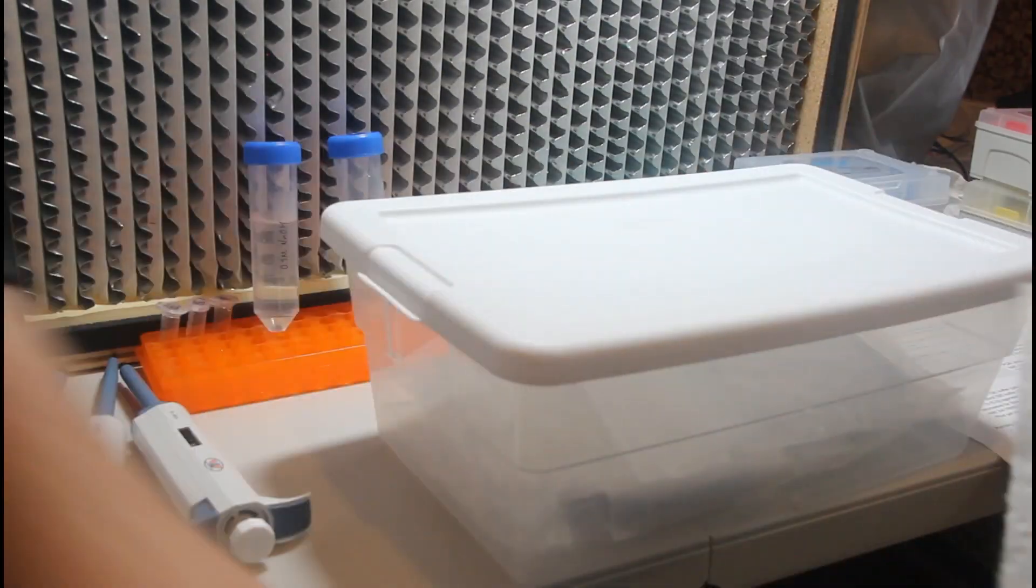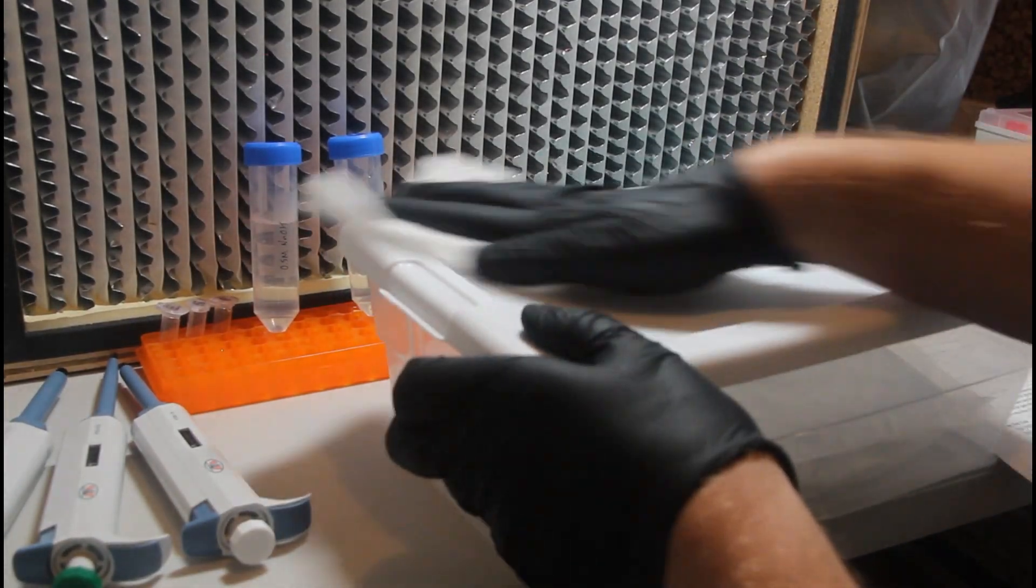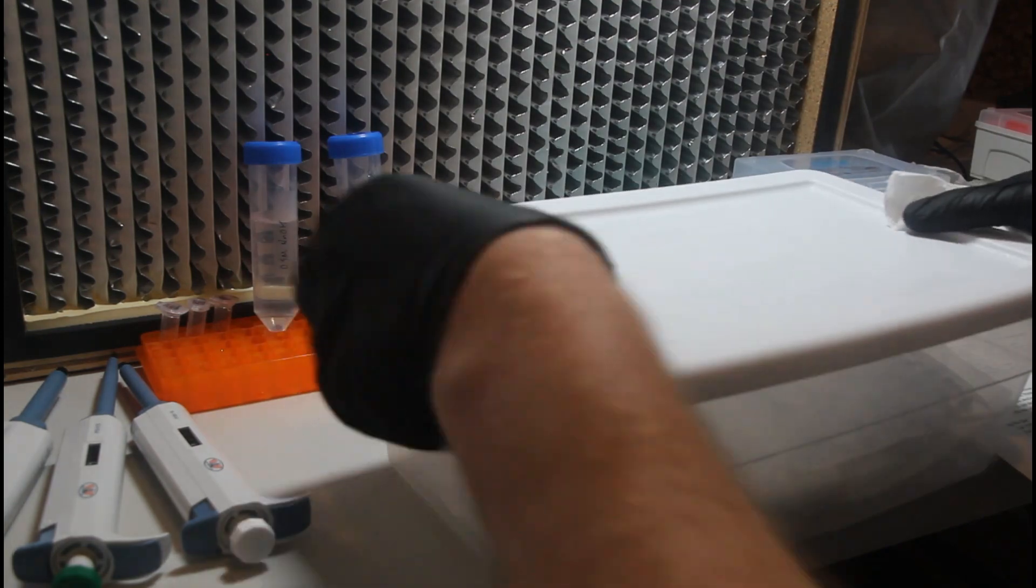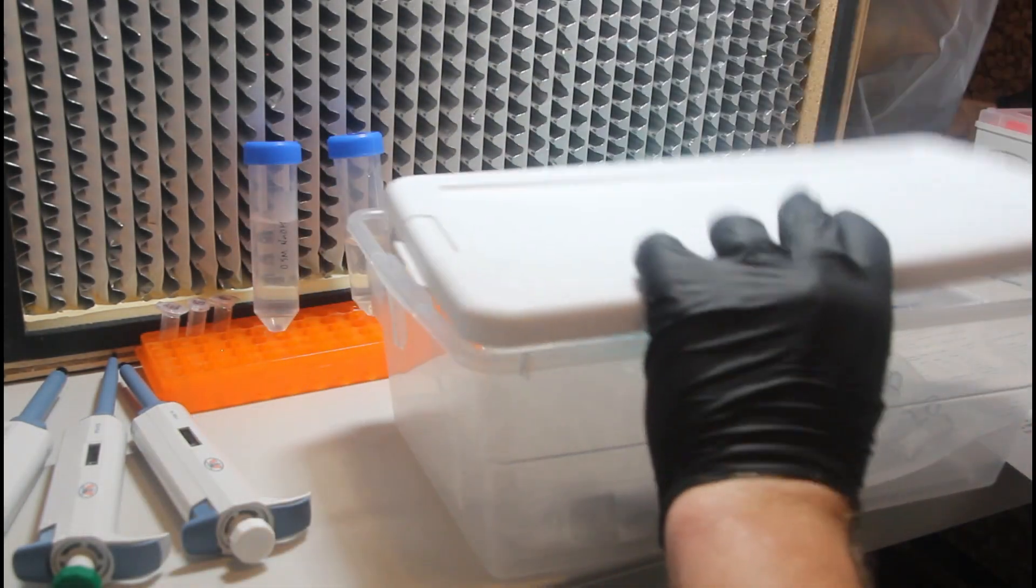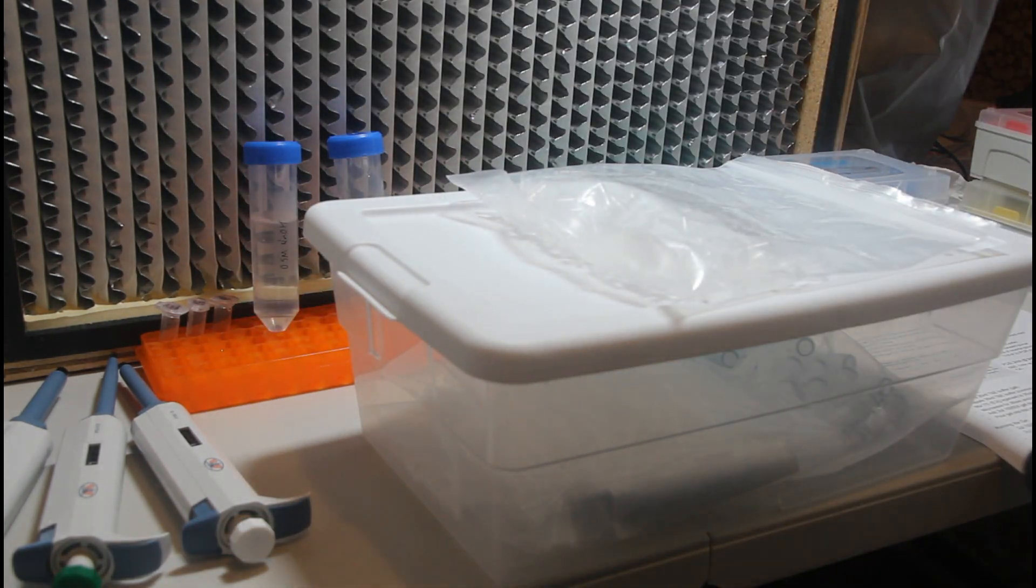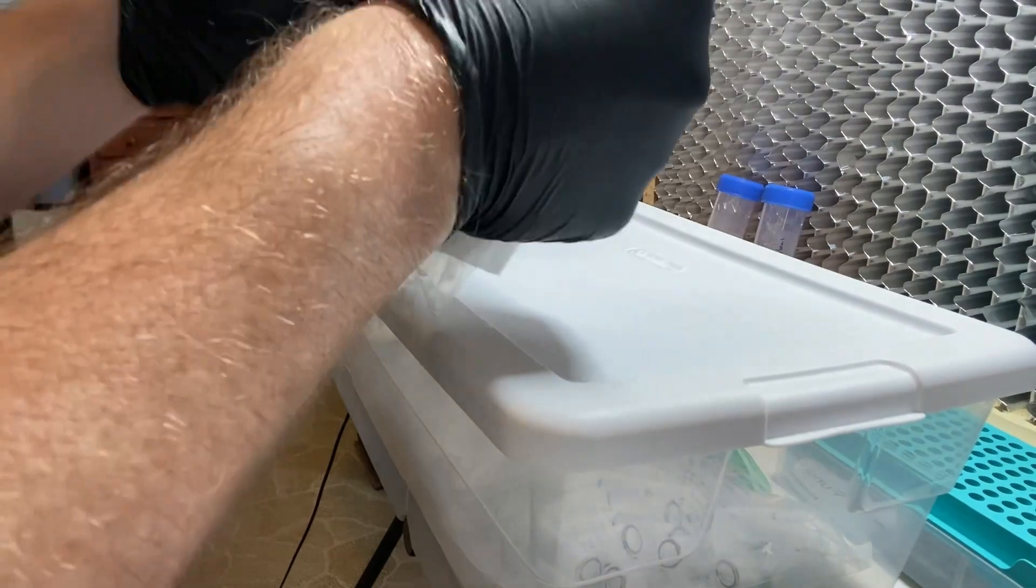The next step is we're going to pull out some tubes that we're going to be using for the procedure. We need micro centrifuge tubes. I like to store my tubes in a shoe box here and then wipe down the exterior before I open it. This just again is to help mitigate contamination. We will need one tube for each sample. We're going to do two today. We're going to do the seagrass fungi and an aspergillus.